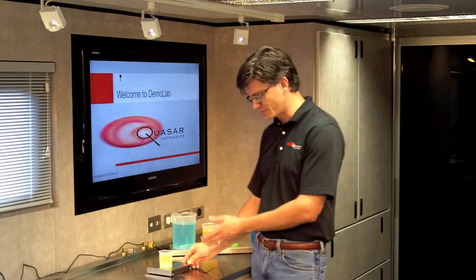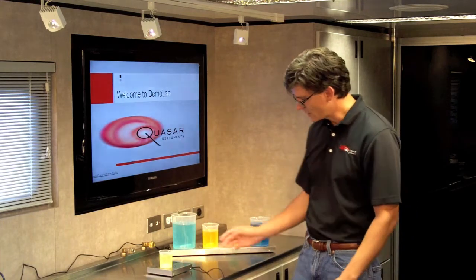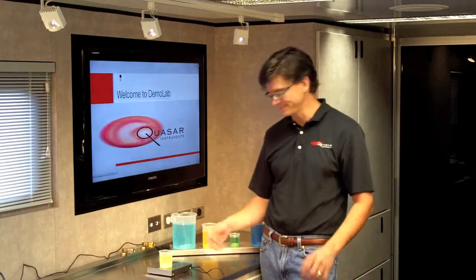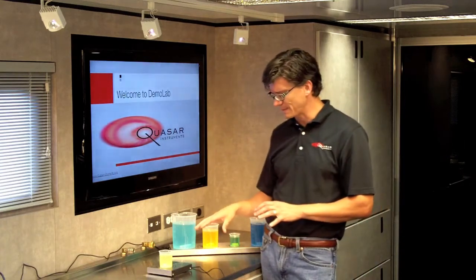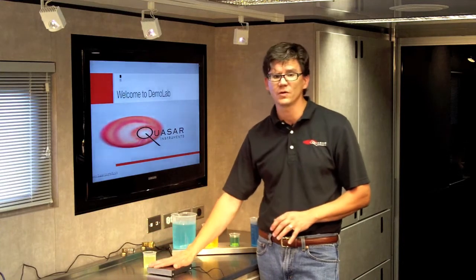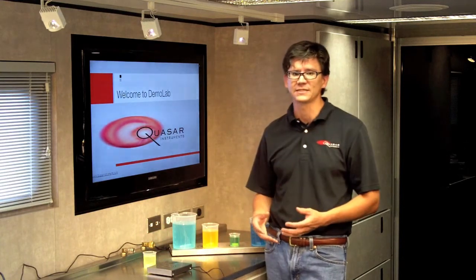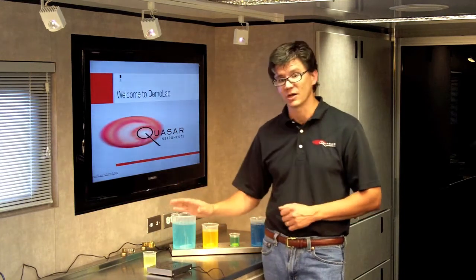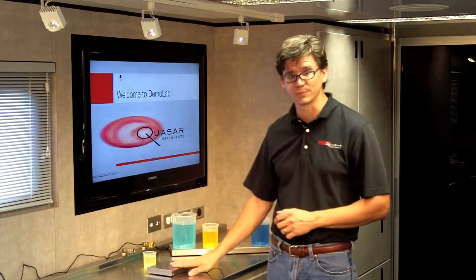We can speed up the stir bar or slow it down in our sample. The units come with a power button so you can turn them off at night. A unique advantage is that they have very low power consumption, so they produce very little heat that gets into your sample. These are not heated stir plates — they are just stir plates.